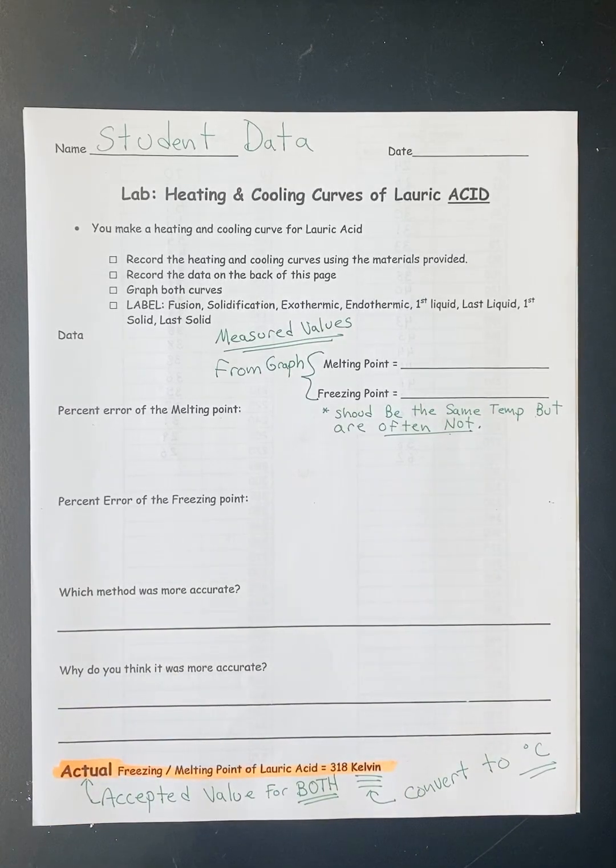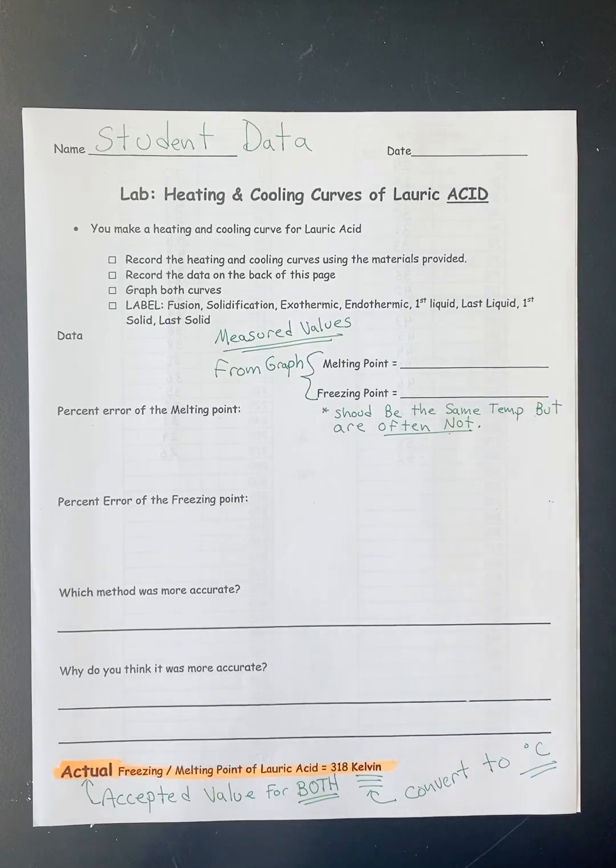Today we're going to be doing a heating cooling curve lab specifically for a chemical called lauric acid, which is actually one of the ingredients found in the original soap. I believe it's still used today but I'm not sure to what extent.